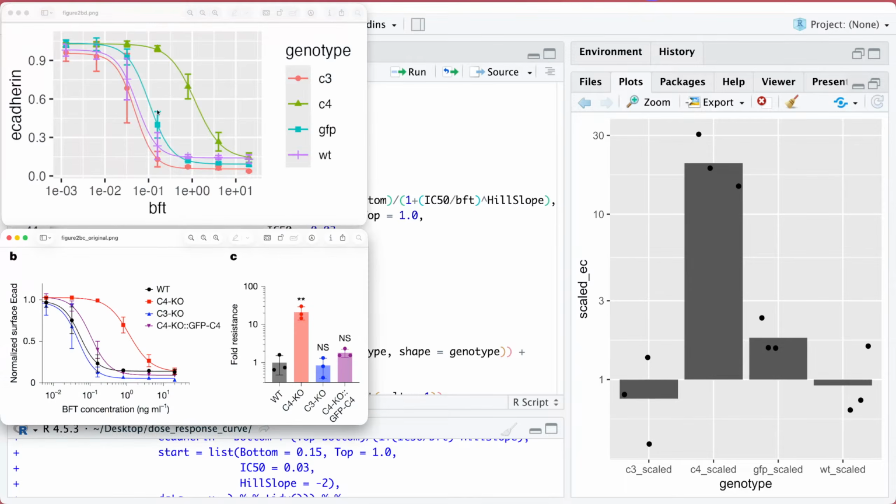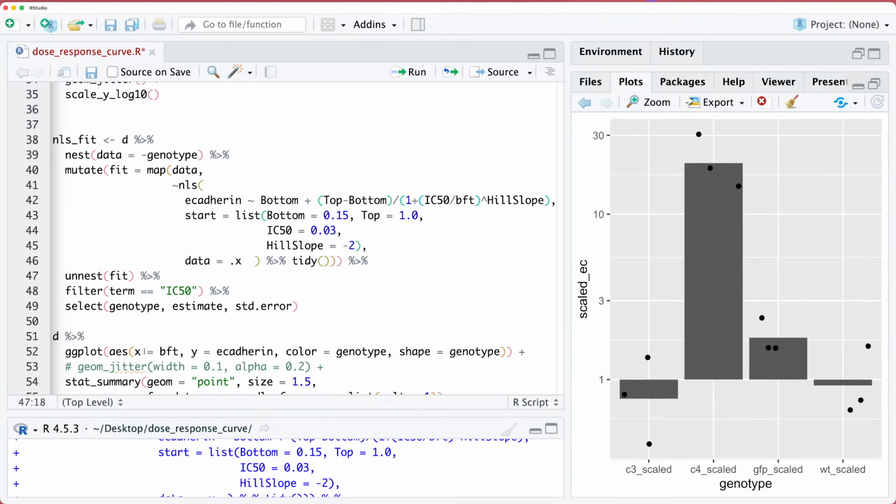So like you can extract what this Y position is for the smooth, but you can't get like the IC50 value. So you'll have to fit the data, okay? And if you're not doing nonlinear, LM or GLM are other options. LM is linear model and GLM I think is generalized linear model. Those are ways that you can fit data with linear least squares, okay?